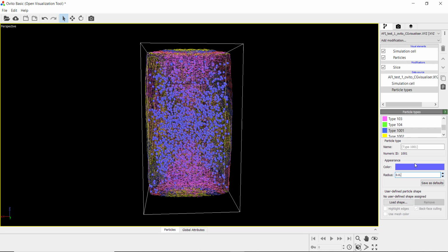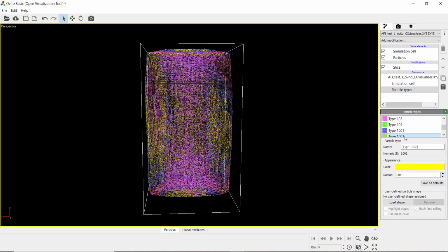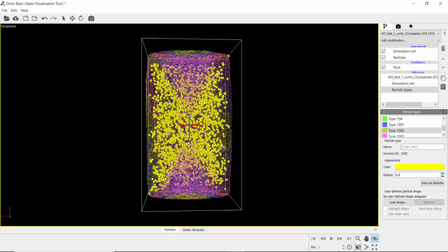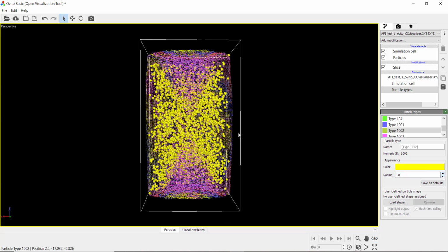If we look at one of the other tile types, so maybe type 2, which didn't really show much for an hourglass, you can see those are quite concentrated on the sides as well. It almost looks like an opposite hourglass, so it's running in the X direction instead of in the Y, like the other example.